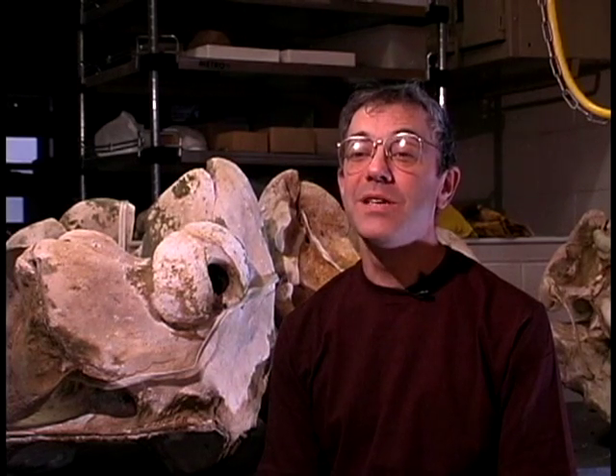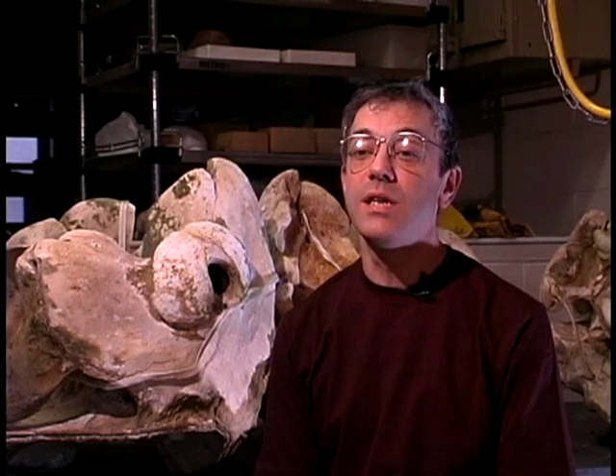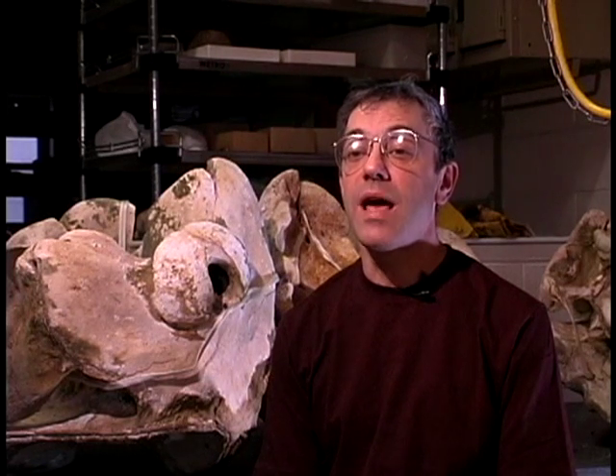Hello, my name is John Osaski, and I'm the osteopreparator for the Smithsonian's Vertebrate Osteology Lab. My job is to prepare animal skeletons for the Smithsonian's Vertebrate Research Collections.